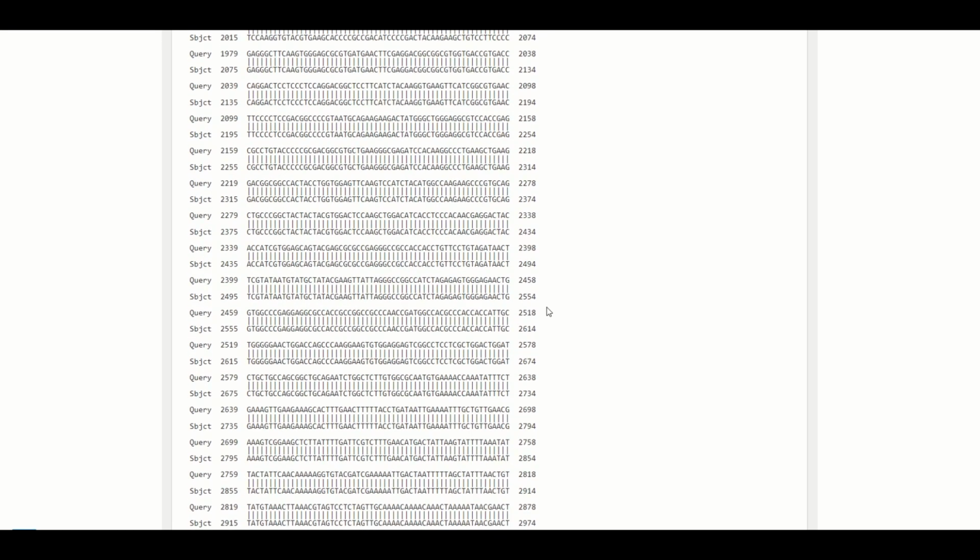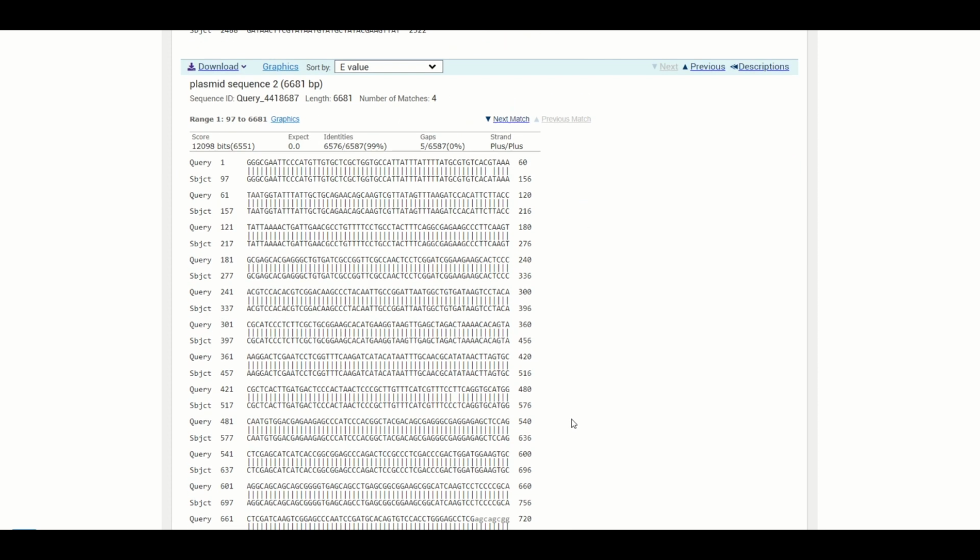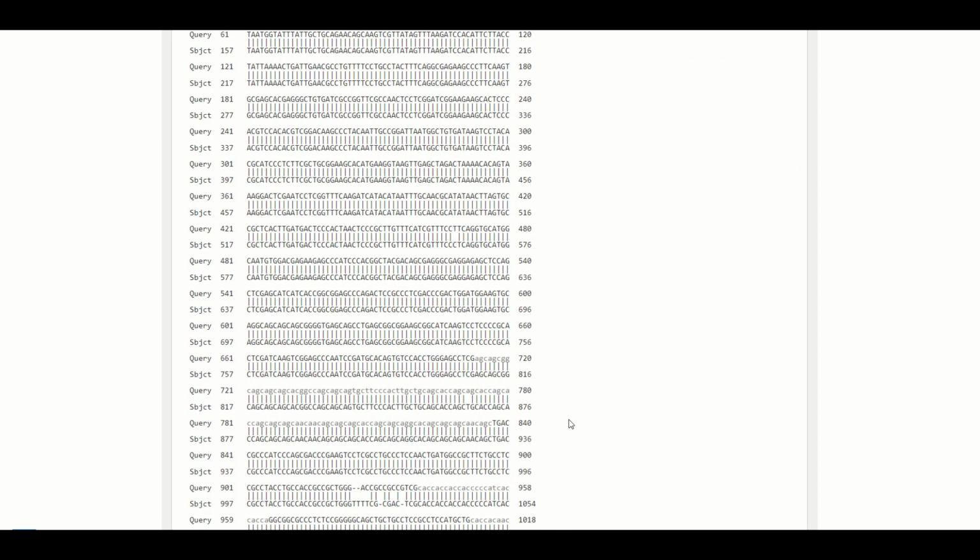I believe APE also has an alignment feature, maybe? No, it definitely does. So you could also use that. It's a very old software. I don't like it, so I'm not going to include it here, but you can check that out also.